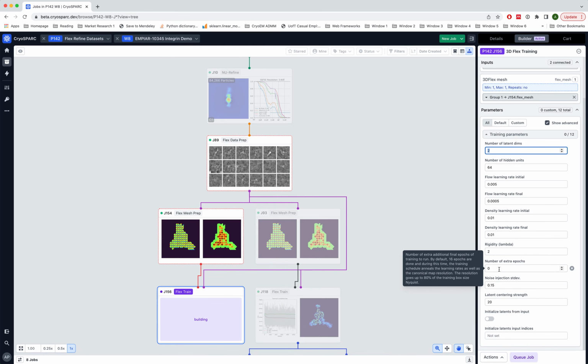So it's fine to have the training job run for longer and use an earlier solution or earlier checkpoint if you feel that over time the results are getting worse after a certain point. And that is something that happens with some machine learning models in general.